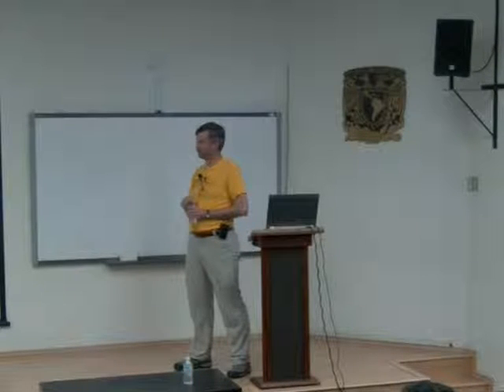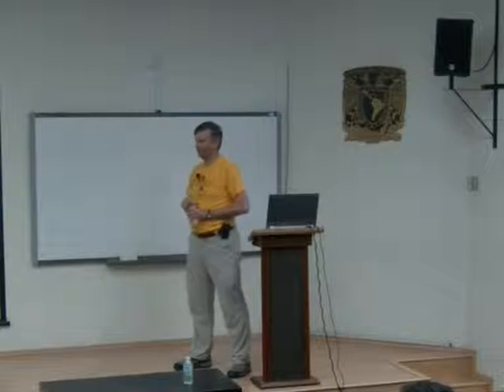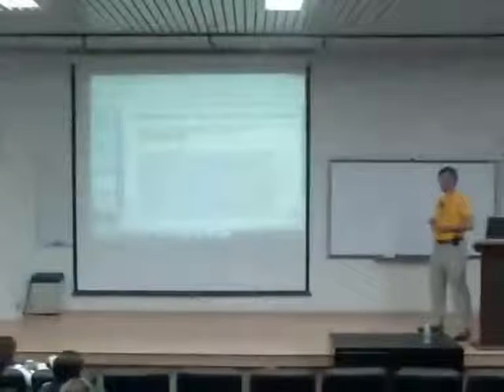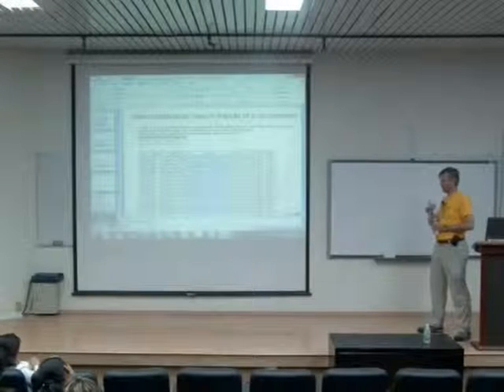Robert, the charge of the peptides, the glycopeptides, is 4 in all of the peptides identified here. How many charges do you permit in the search? I mean, when you put in the parameters, do you allow the fragmentation for just 1, 2, 3, 4, 5? How many charges do you permit?